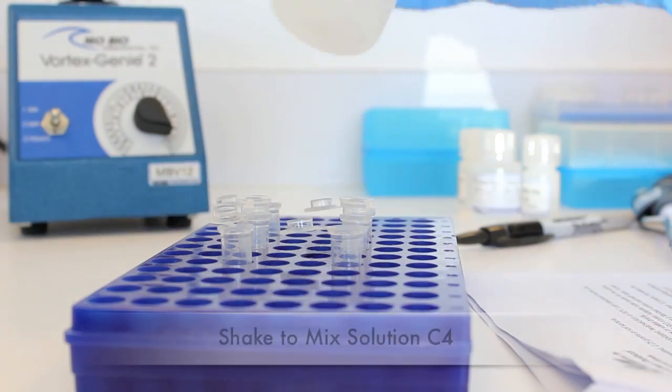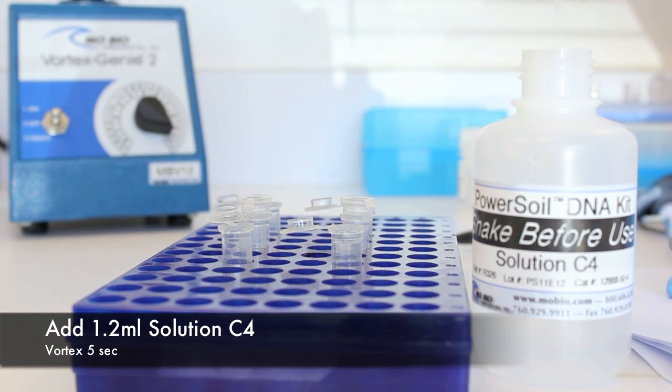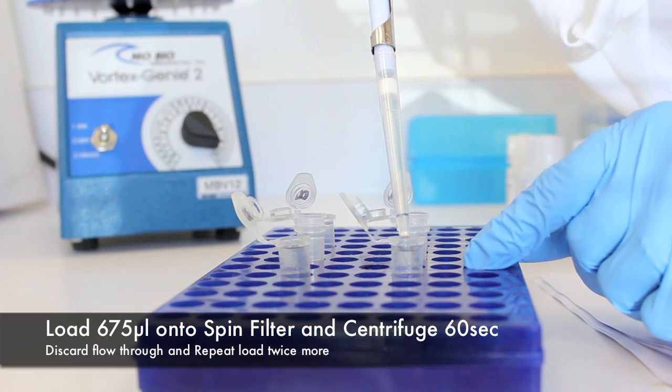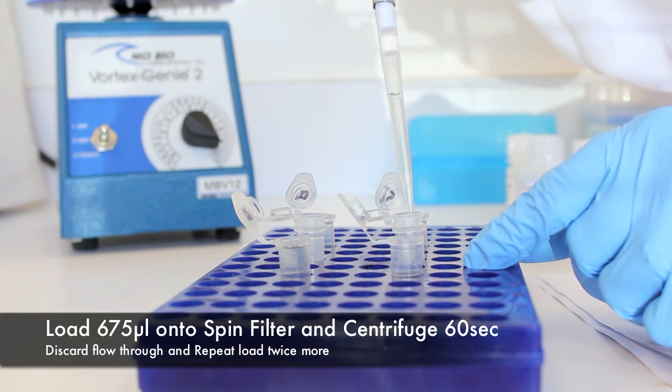Shake to mix solution C4 before use. Add 1200 microliters of solution C4 to the supernatant and vortex for 5 seconds. Load approximately 675 microliters onto a spin filter and centrifuge at 10,000 times G for 1 minute.